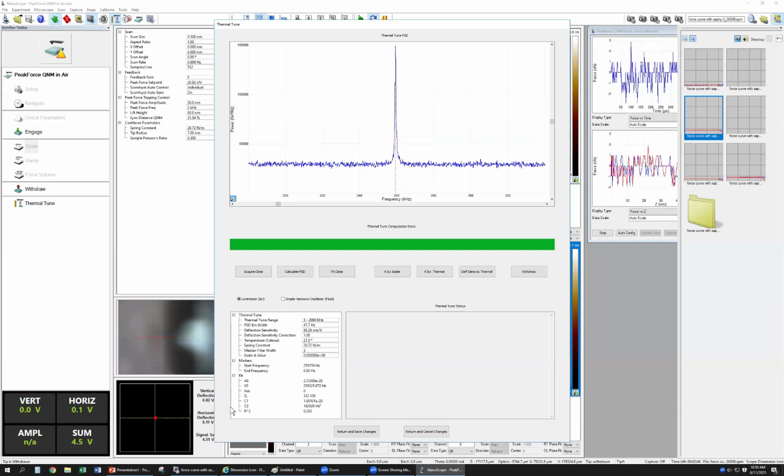They already have the unit here. Okay. And the frequency is the same. Frequency is 259.3. And the Q factor is 322.13. Okay. All these parameters finished.